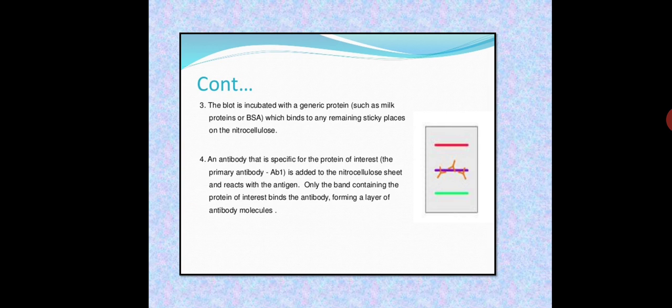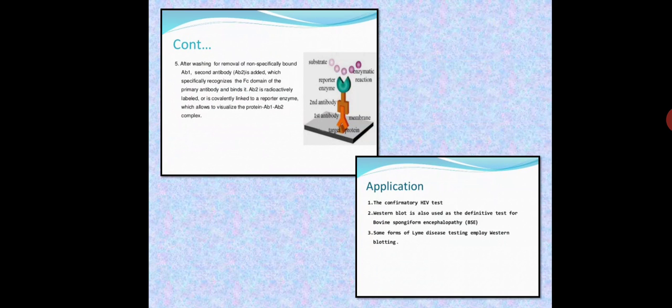So these antibodies act as the detector and these antibodies are specific to our target protein or protein of interest. This antibody can bind to our specific protein. ऐसे antibodies हम use करते हैं, okay. So we design specific antibodies against our target protein. But before doing this technique, we perform the blocking method. Okay, ये antibodies add करने से पहले हम blocking method perform करते हैं.